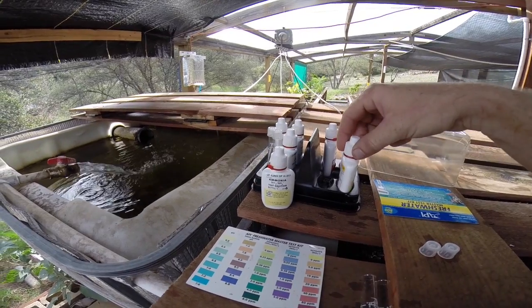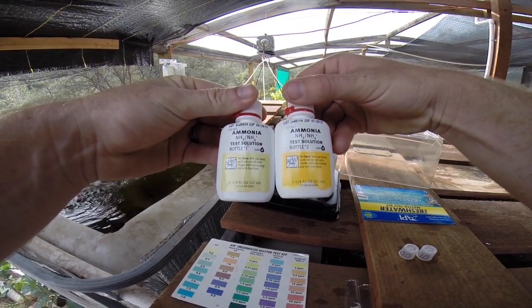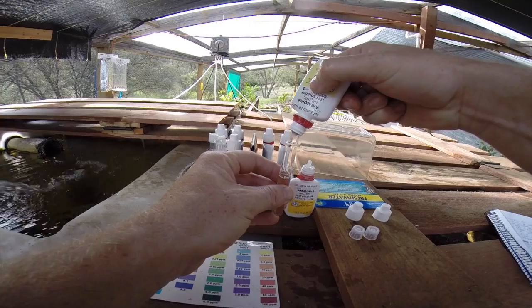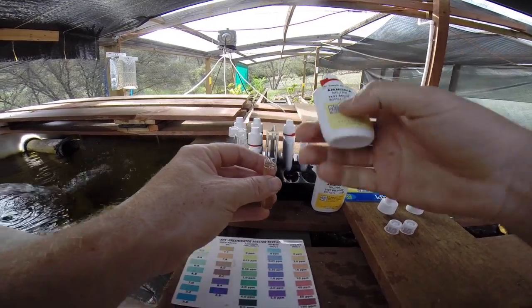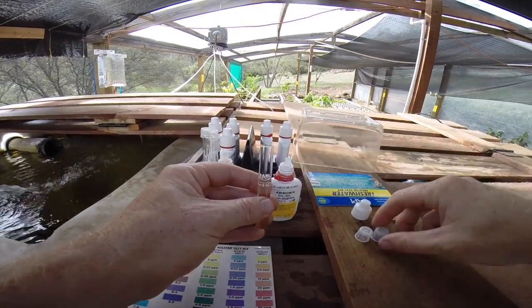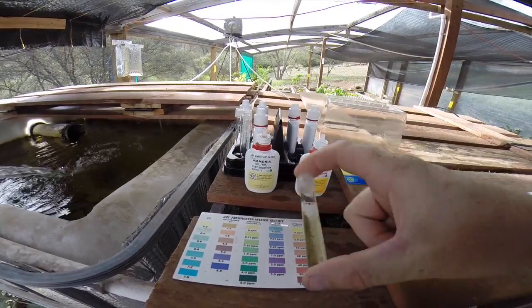Now let's move on to checking the ammonia levels. Start by filling a clean test tube to the 5ml mark, then add 8 drops from test solution bottle number 1, then add another 8 drops from test solution bottle number 2. Cap the test tube and shake vigorously for 5 seconds, then wait 5 minutes for the color to develop.